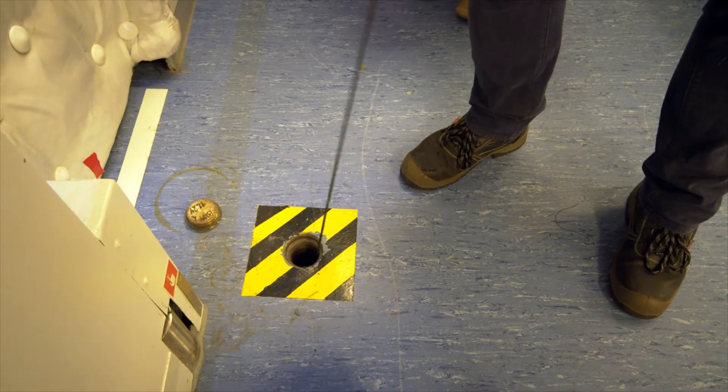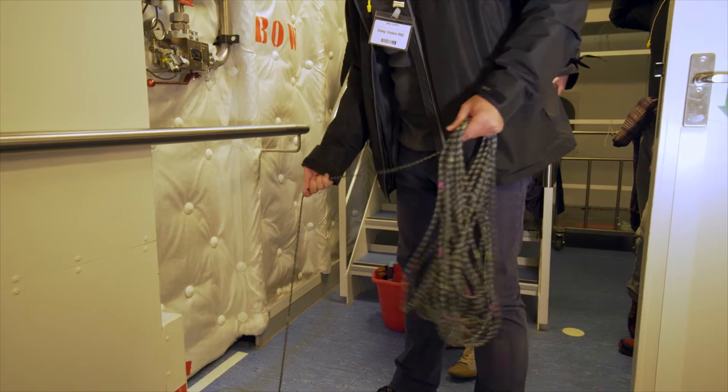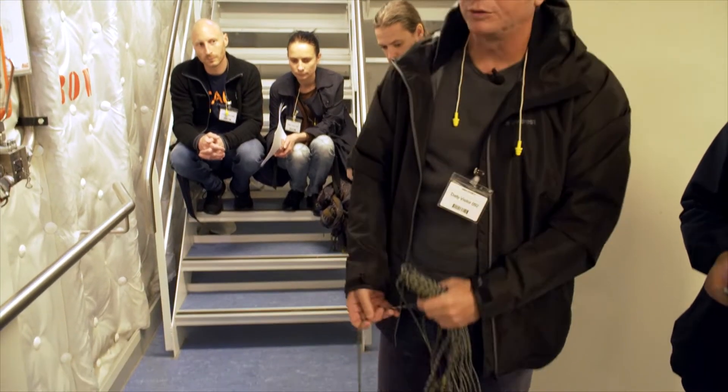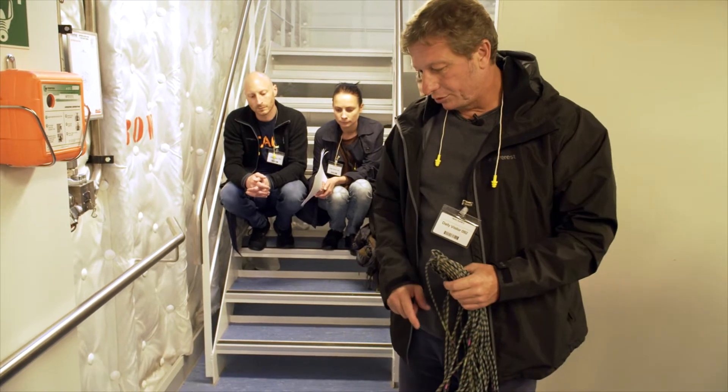This will go down, and then you will see when we are at the depth or when it hits the bottom — the valve opens and gets the sample — and you pull it out and then we can measure here.